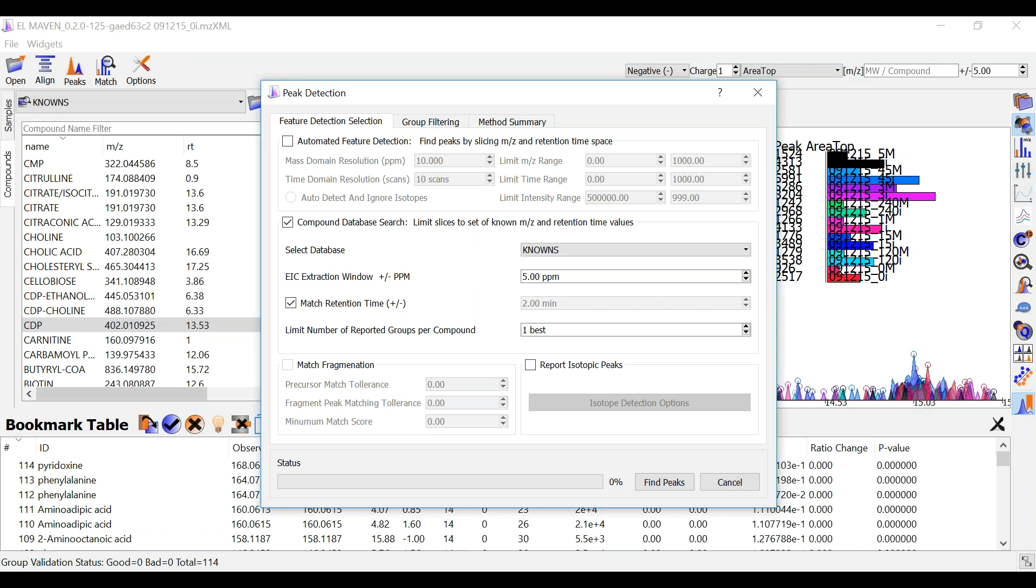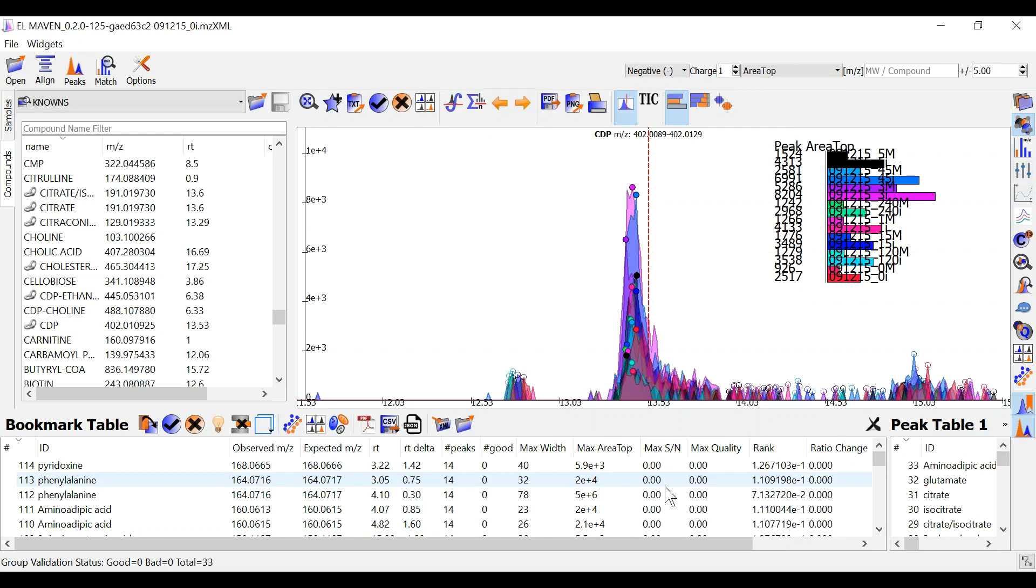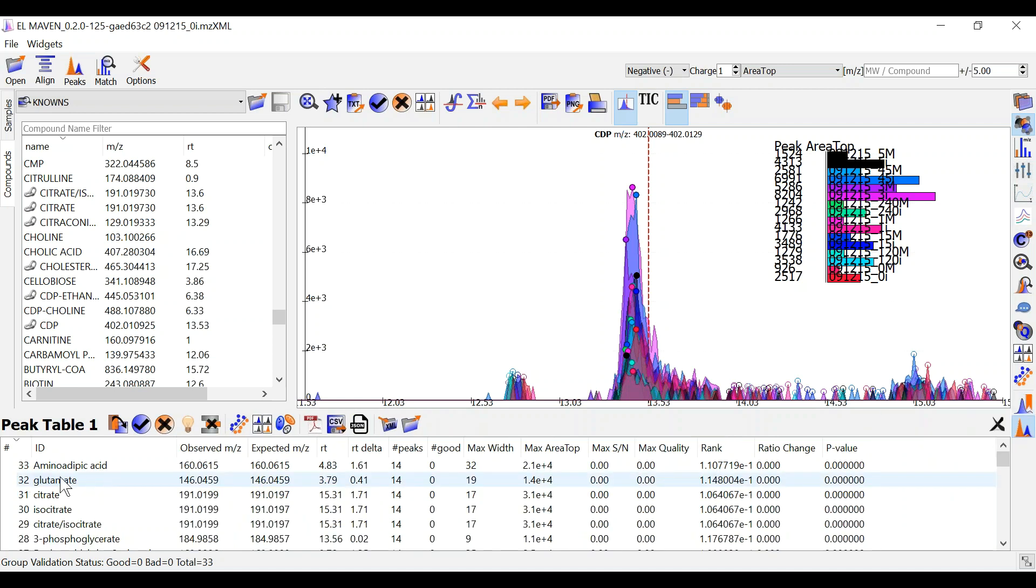Since my data is unlabeled, I have not checked report isotopic peaks. Once I have adjusted all the parameters, I can click on find peaks and ElmAven will make a peak table. You can look at this peak table here.